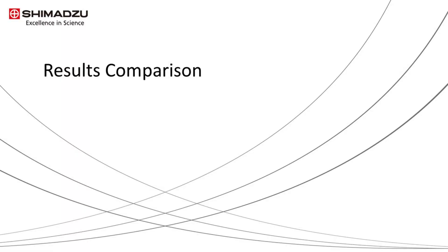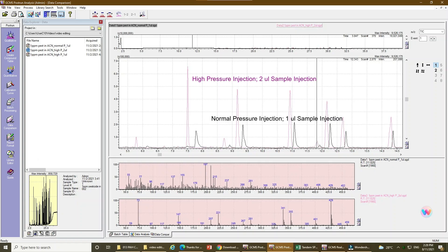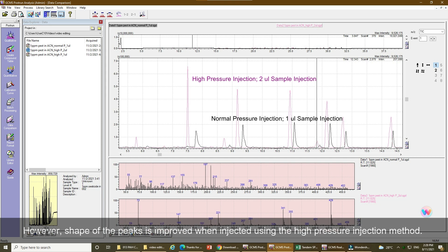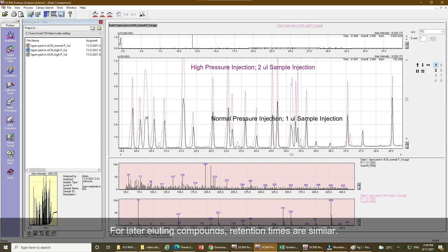Once the data acquisition has been completed, we may compare the chromatograms to check for the results. In this example, we compare the sensitivity of 1 microliter injection with normal pressure injection method and 2 microliter injection with the high-pressure injection method. The front eluting compounds are eluting faster in the high-pressure method compared to the normal injection method. However, the shape of the peaks is improved when injected using the high-pressure injection method. For the later eluting compounds, retention times are similar.